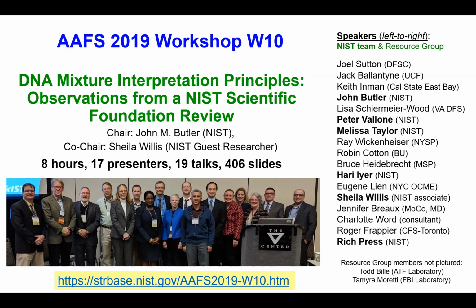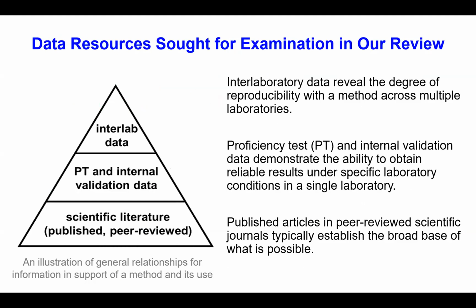So the resources that we've been looking at in our review are the scientific literature, proficiency tests, internal validations that are publicly available, and then interlaboratory data. For the various reasons here, interlaboratory data provides the biggest view of seeing the degree of variability or reproducibility across laboratories. The PT and internal validation demonstrate the ability within a laboratory, and then the scientific literature gives you a broad base of what's been studied.